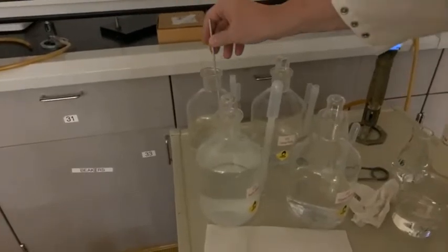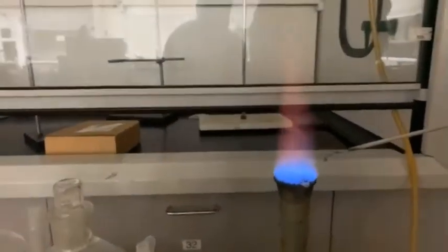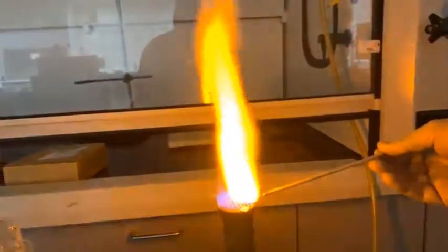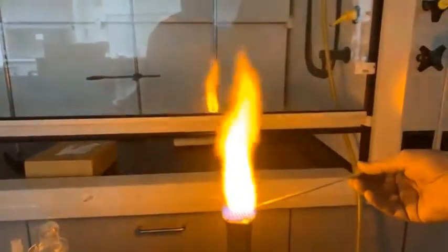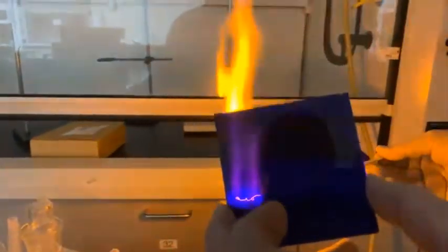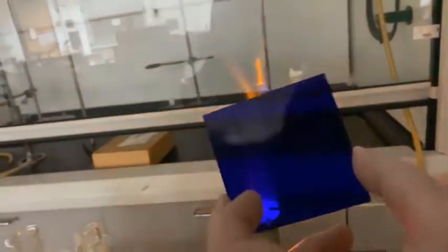Okay, we're just going to gently touch the liquid. Okay, watch carefully. See how intense and yellow and bright that is? If you have sodium, your intensity better be that bright. It's an incredibly bright yellow flame. Look through the filter and the flame should disappear. Does it disappear? No, it doesn't. Doesn't disappear? Then we got somebody else glowing in there. Yeah, it disappears. I don't see it.